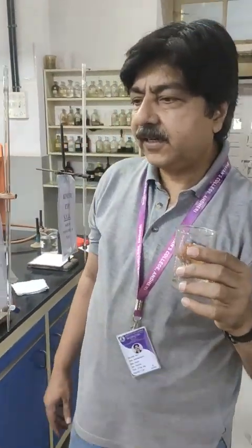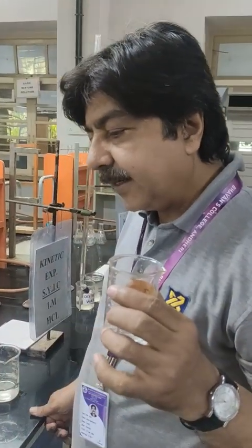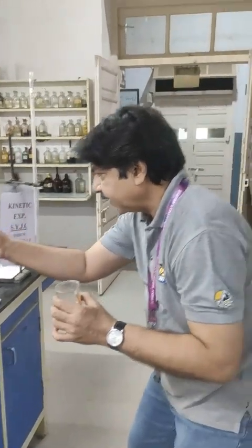Now after taking 30 ml of sodium thiosulfate solution, to this we are mixing 18 ml of water. I will take 18 ml of water from here.